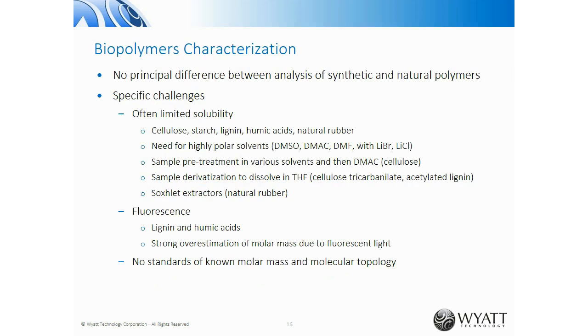Concerning the characterization of biopolymers, I'd like to emphasize that generally there is no principal difference between the analysis of synthetic polymers and natural polymers. We use the same instrumentation and we want to get the same kind of information. However, in the area of biopolymers, we can encounter several difficulties.